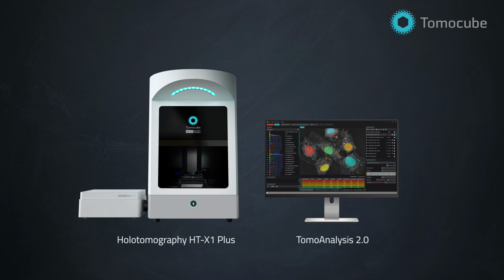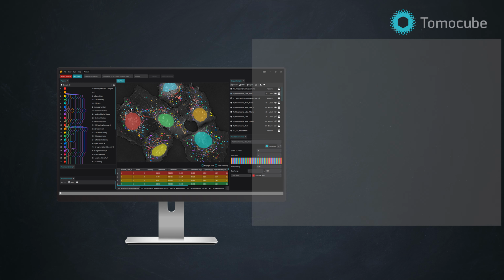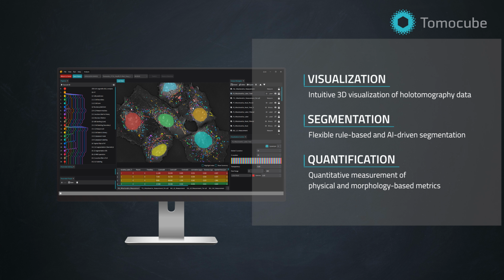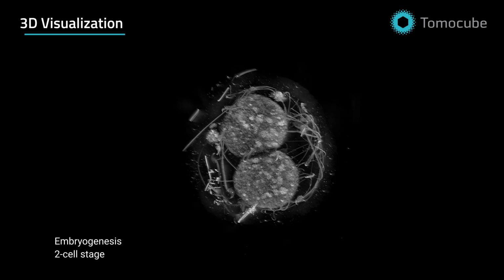Experience the synergy of cutting-edge holotomography imaging and advanced analysis with TomoAnalysis 2.0. From groundbreaking 3D visualization to precise segmentation and quantification, our platform transforms your data into discovery. Step into a new dimension of discovery.